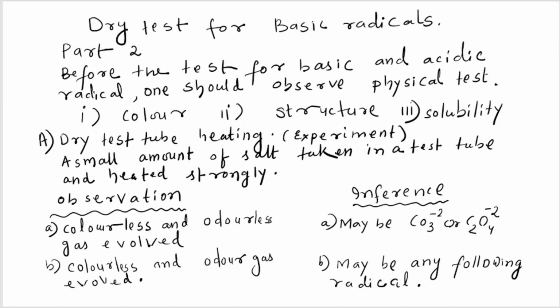This is part 2. In part 2, I want to explain the main important tests for basic radical in dry test, heating and wet test. Here, before the test for basic and acid radical, we will first see the physical tests.